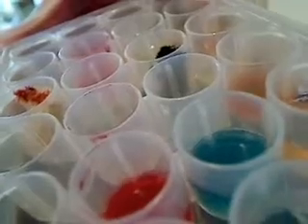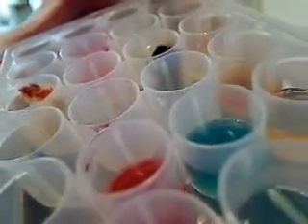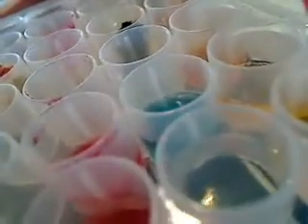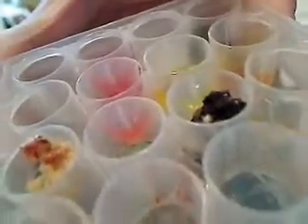Okay, so let's take a look with the copper sulfate. The only reaction that you get is with the albumin. You get a color change. So again, see that dark blue? That's a reaction. The others are all kind of light blue. Nothing, nothing, nothing. So the only reaction you're going to get with the copper sulfate is with that albumin.